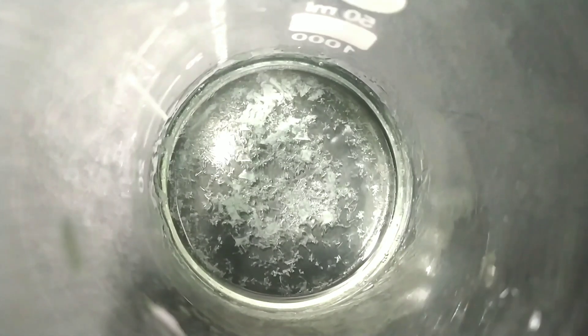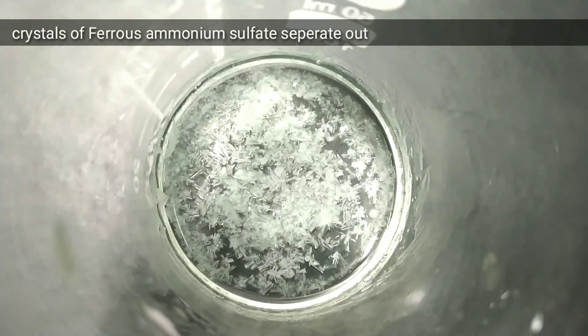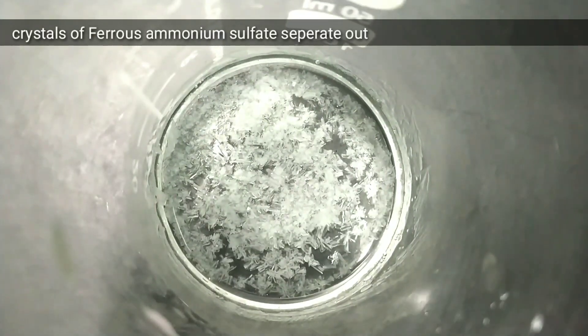If you see some crystals forming that means the crystallization point has been reached. So we cool the solution and on cooling the crystals of ferrous ammonium sulfate separate out.